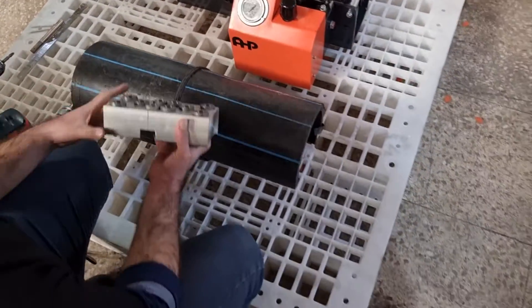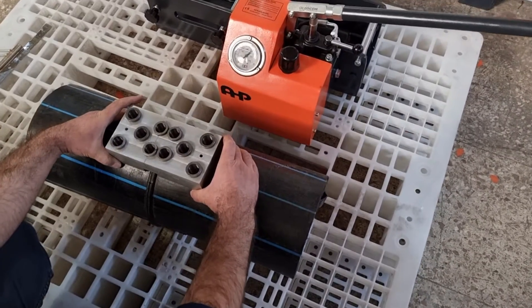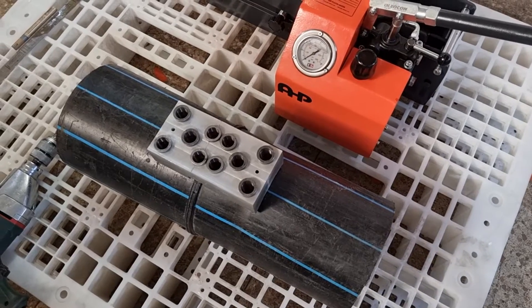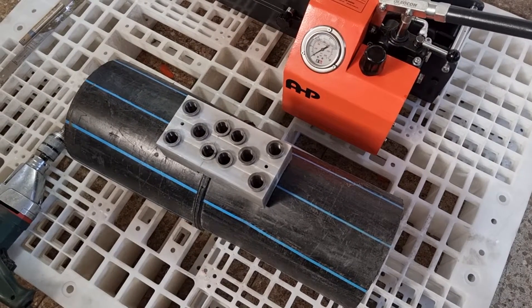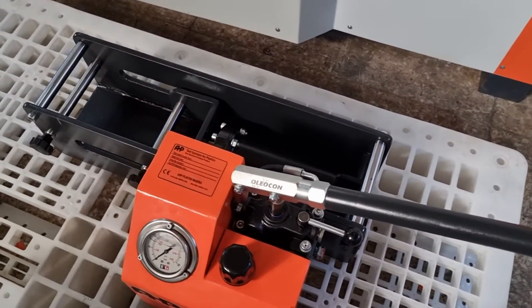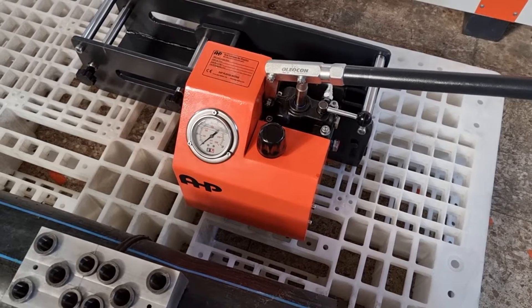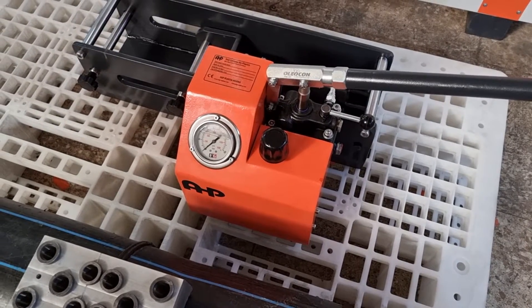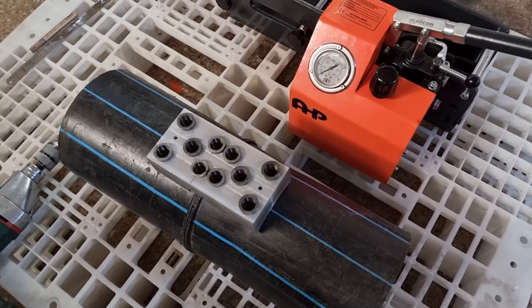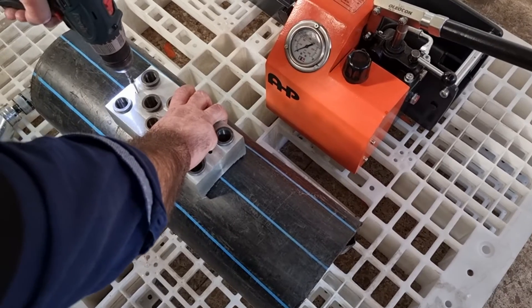The template dimensions conform to ISO and ASTM norms and depend on the customer's request. The cross-section area of the pipe can be 90%, 95%, or 85% — it depends on the request and the standard. The machine itself is a hydraulic unit with pressure up to 100 or 200 bar; this parameter also depends on the customer request and on the thickness of the pipe samples.